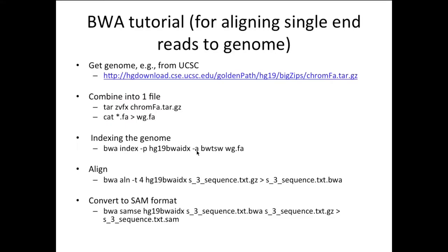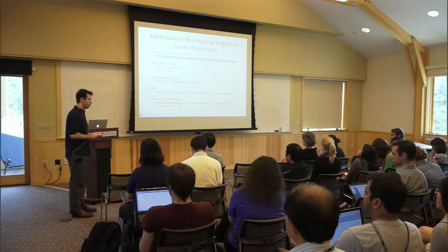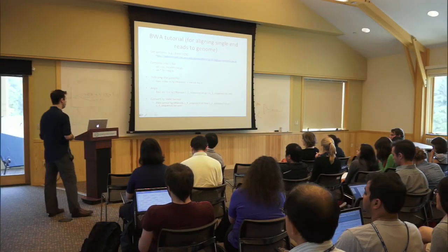So what people have come up with is data structures. It's basically tree-based structures that allow you to directly go to the more likely matches of your short reads on your genome. It's essentially building a tree-based structure out of a genome that allows you, when you have a short read, to kind of thread it through the tree structure and identify likely matches really quickly. And that really works very well, and it increases the speed of the short read mapping process by orders of magnitude. Now it basically takes less than a day to align short reads from one data set, for example, to a human genome.